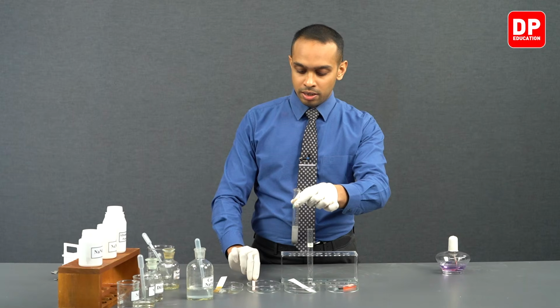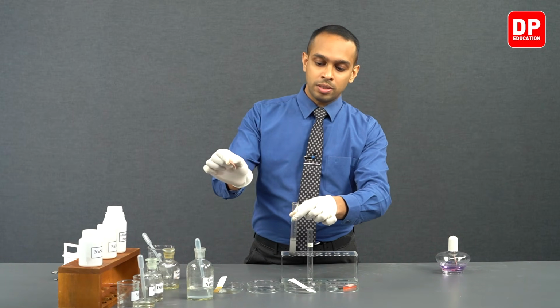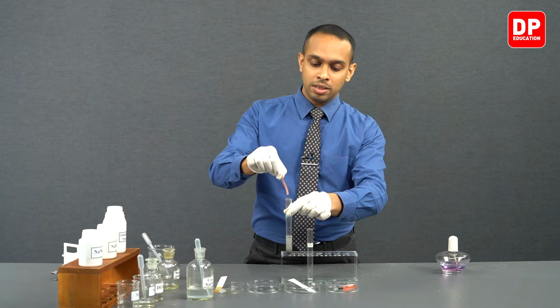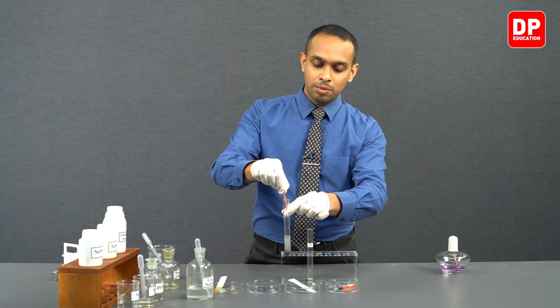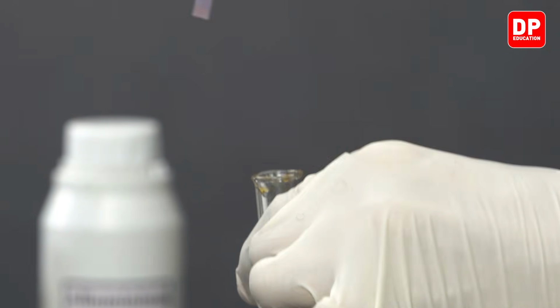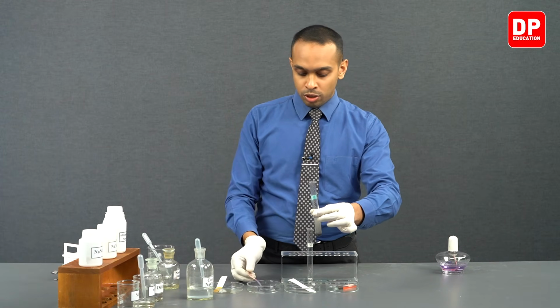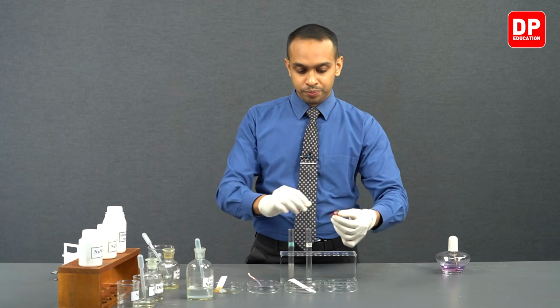Now let's take a red litmus paper and observe what happens. Now we have made the red litmus paper a little wet. Let's insert the red litmus paper and expose it to the ammonia gas that is released. You can see it is changing its color to a blue color. Let's observe that change one more time.